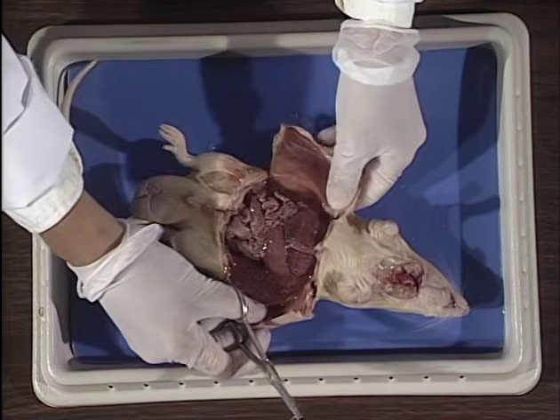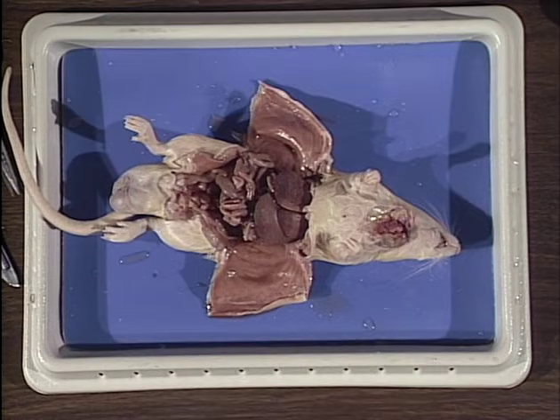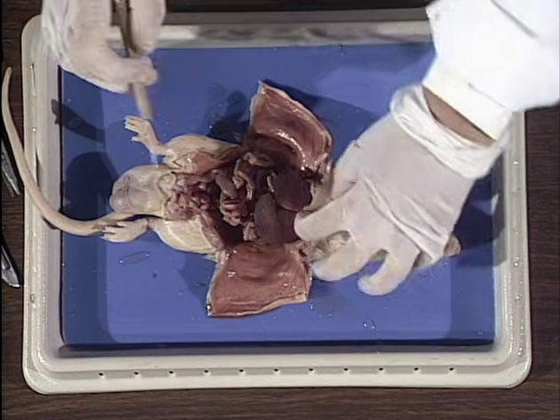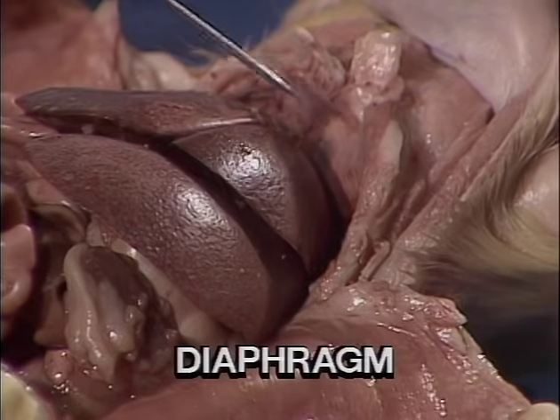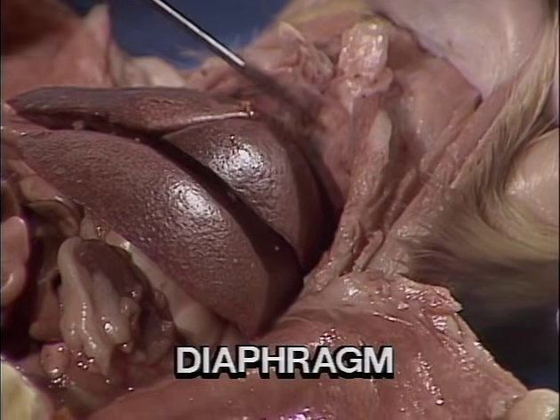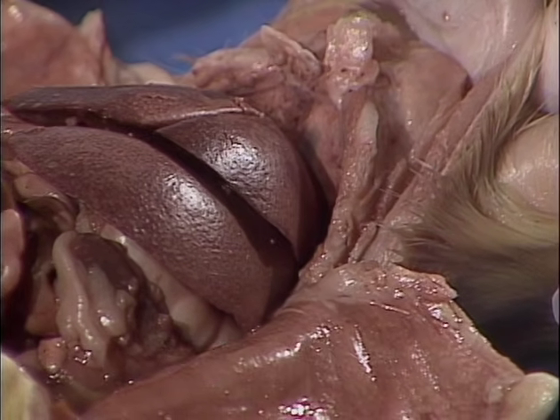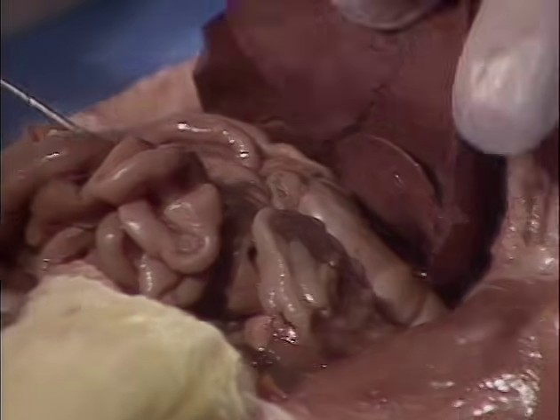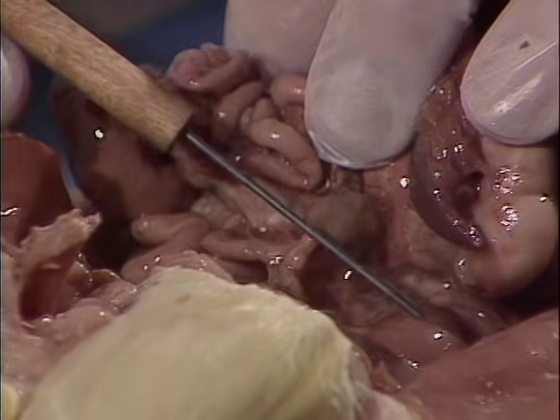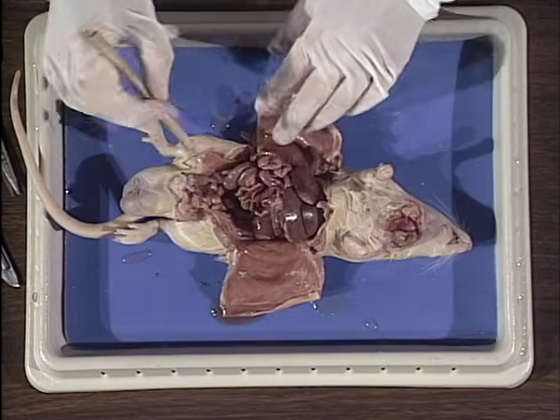It will now be necessary to rinse out the body cavity so that we may see the organs more clearly. After rinsing out the rat, we are ready to study the abdominal cavity. Note the diaphragm, the sheet of muscle that separates the abdominal cavity from the thoracic cavity. In the abdominal cavity, we can see many familiar organs, such as the liver, the stomach, the intestines, kidneys, and reproductive structure. We will examine each of these organs in detail.